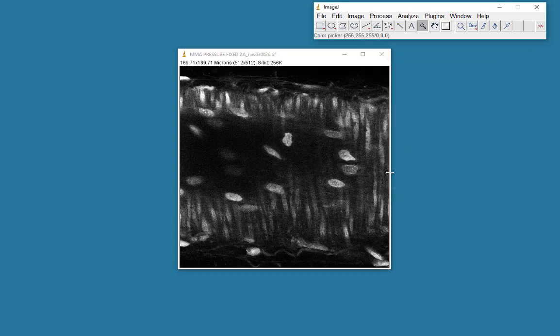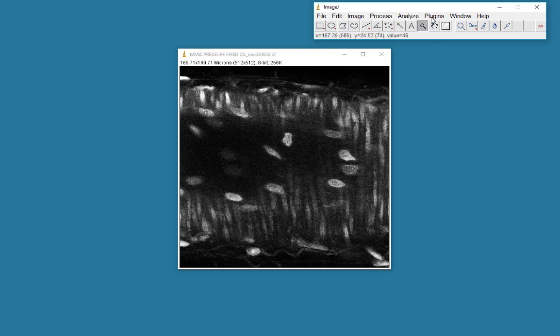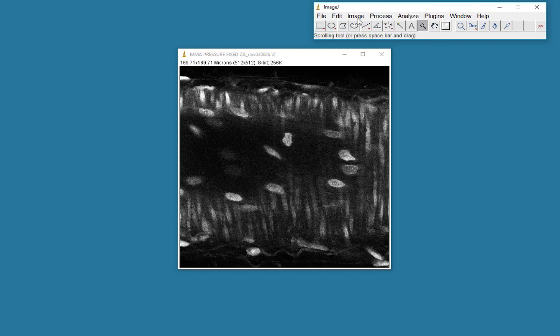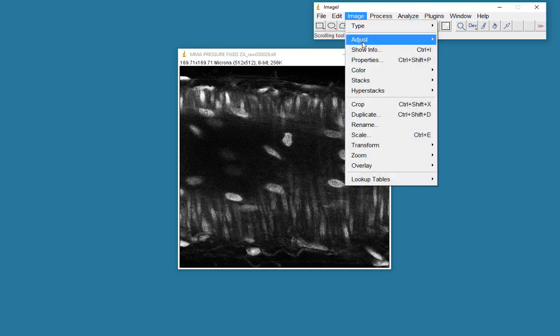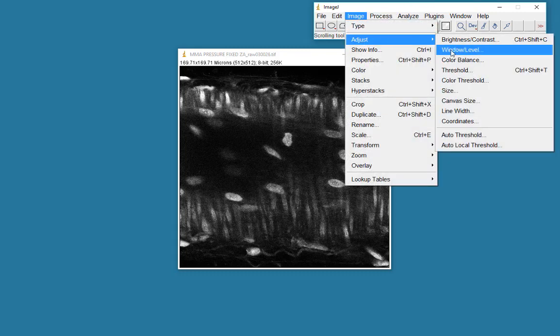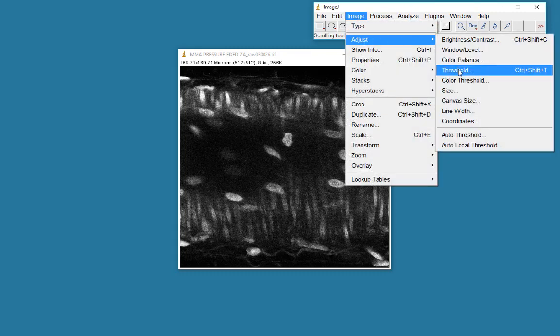So I now want to select intensities which will pull out these endothelial cell nuclei. I go to my adjust threshold.